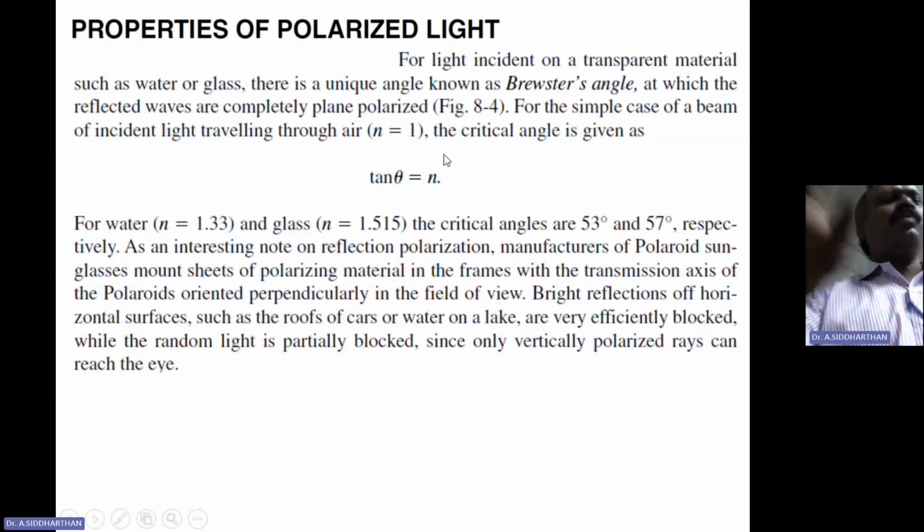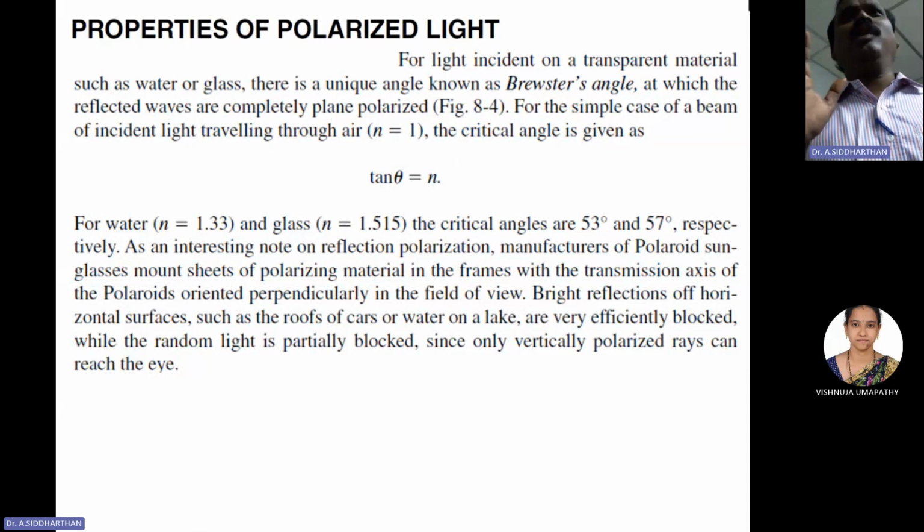Okay, so today we'll see what polarizing light is, and how that is also used to enhance the contrast of an image. The technique is called polarization microscopy. Before you go to polarization microscopy, you should understand what polarization is.